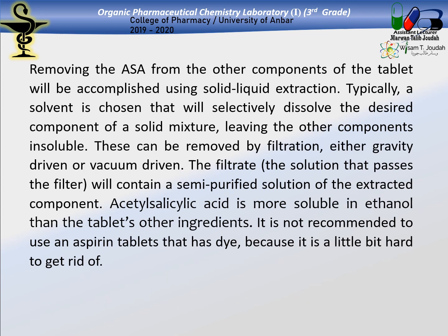Removing the acetyl salicylic acid from the other components of the tablet will be accomplished by using solid liquid extraction. This is the type of technique that we will be using today in our experiment. Typically, a solvent is chosen that will selectively dissolve the desired components، يعني فقط اللي احنا نريده راح يذوب of the solid mixture, leaving the other components insoluble.